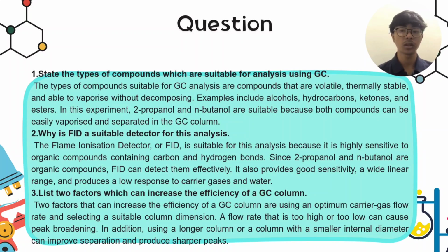The second question is, why is FID used for this analysis? The answer is, the flame ionization detector or FID is suitable for this analysis because it is highly sensitive to organic compounds containing carbon. 2-propanol and N-butanol are organic compounds. It also provides good sensitivity, a wide linear range, and produces a low response to carrier gas and water.